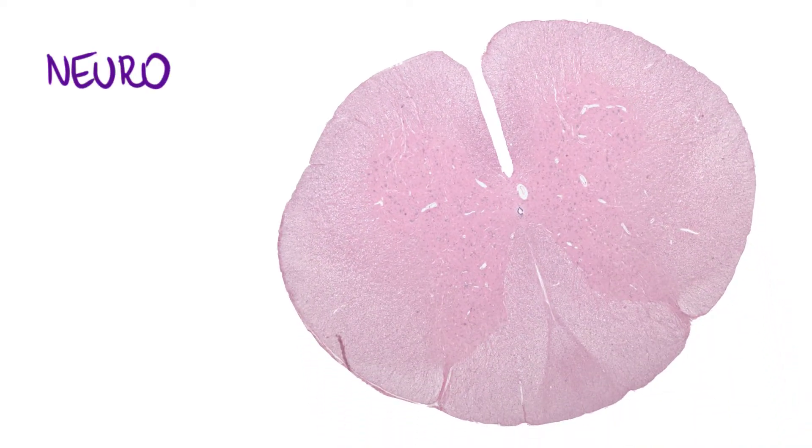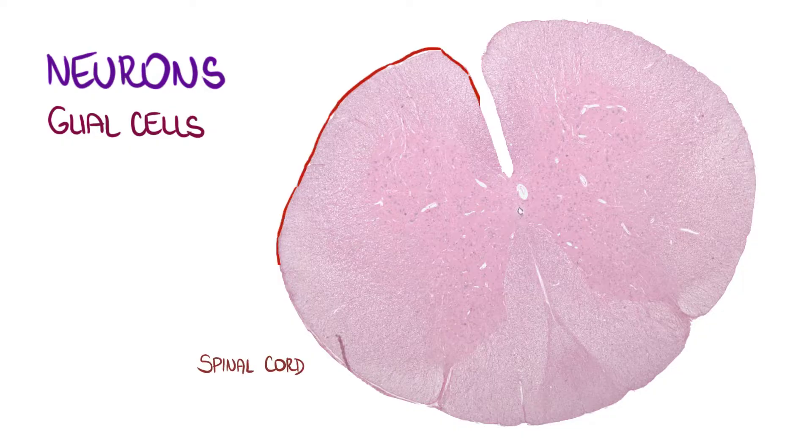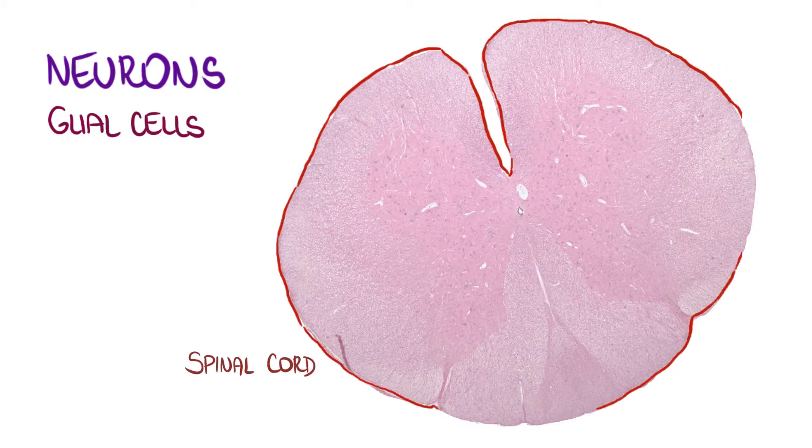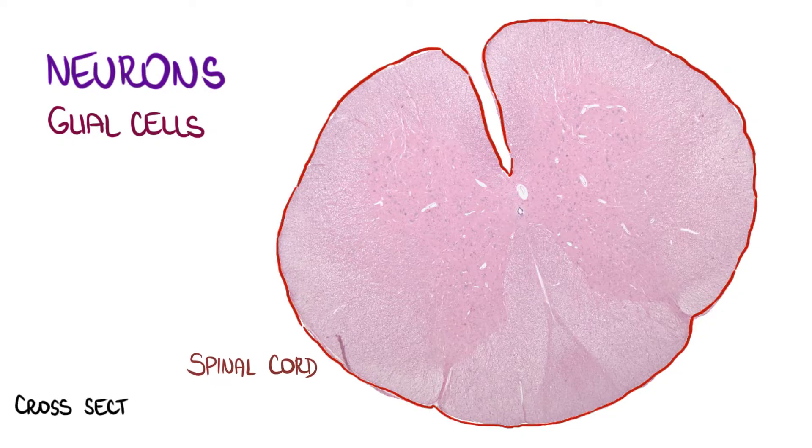In this video I will show you how to recognize neurons and glial cells in the spinal cord. This is a cross-section of a spinal cord.